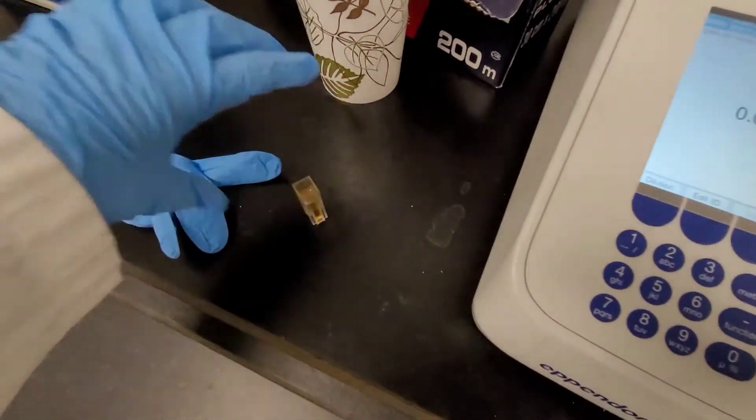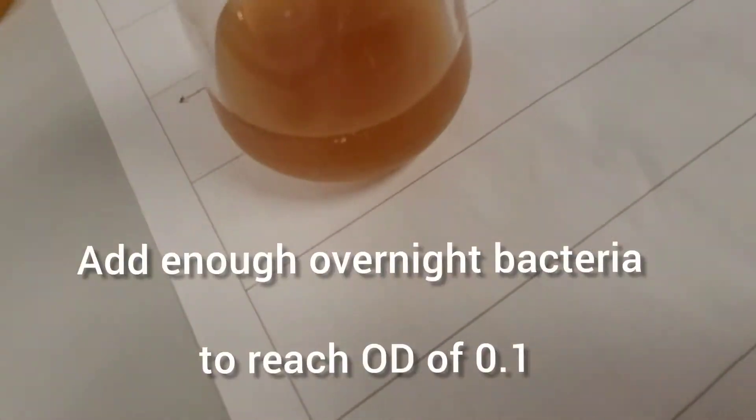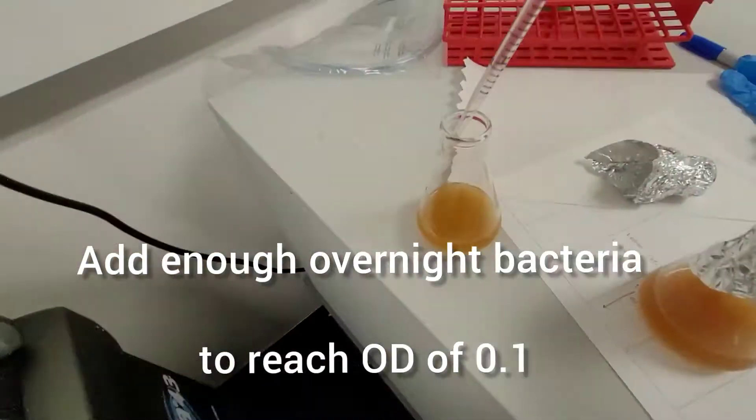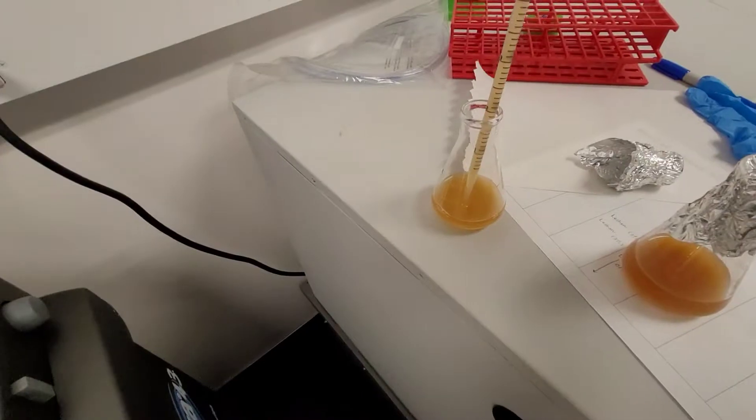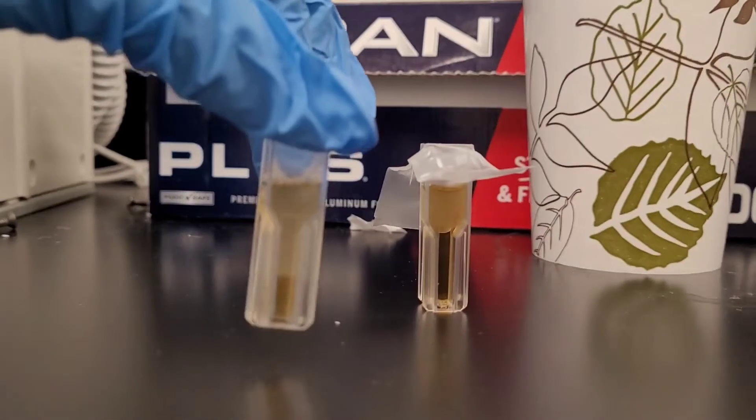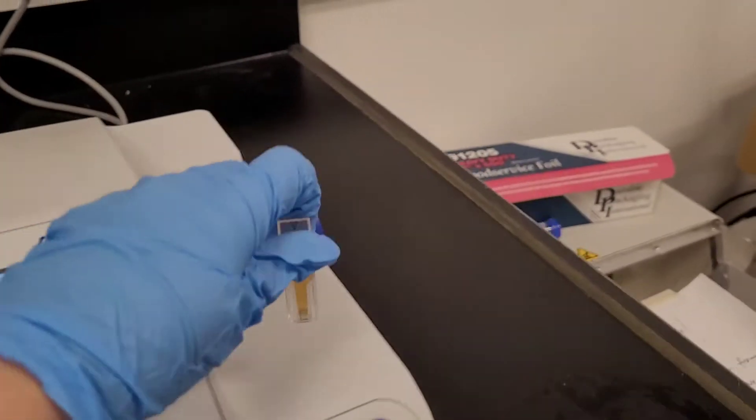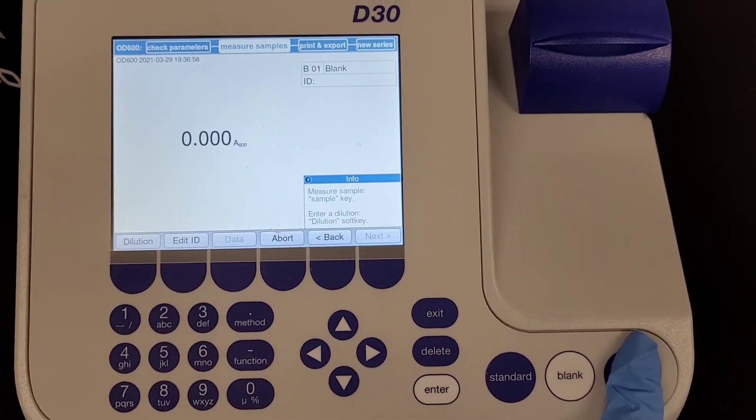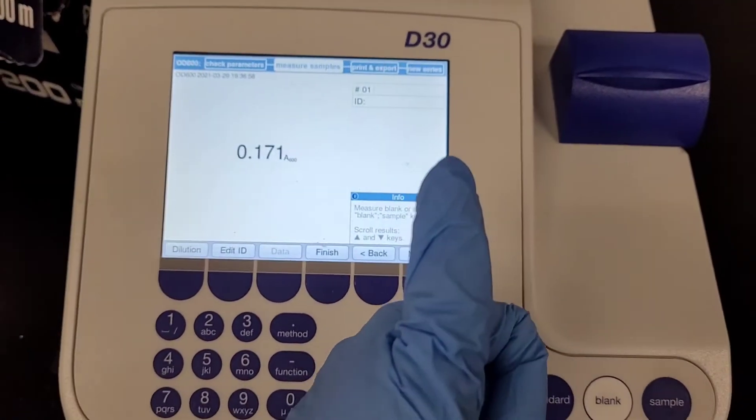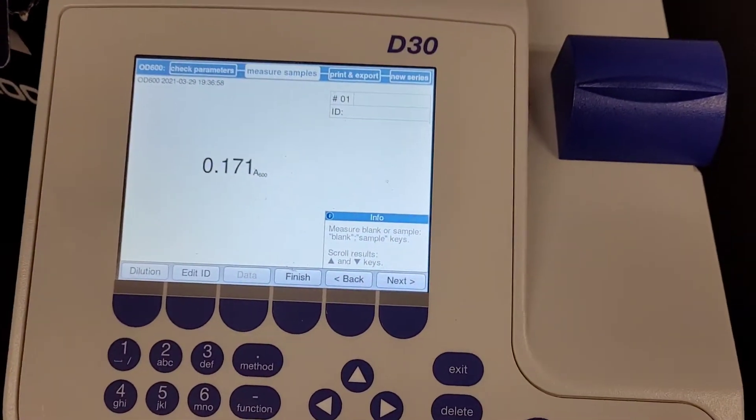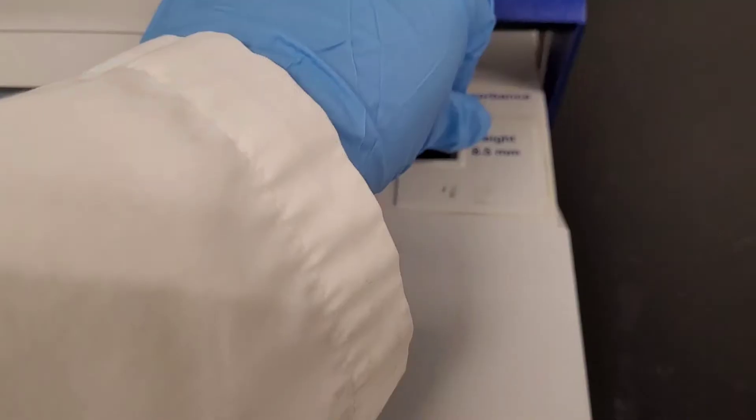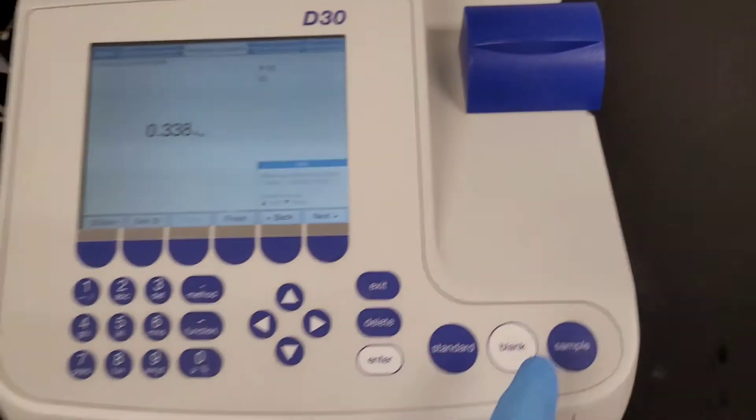When you put your solution that has bacteria, it should give you a positive value, not zero. Next, you want to add from your overnight culture enough bacteria to your clear one liter flasks so that your optical density or your cloudiness will be at least 0.1. 0.1 would be a great point to start. I did that, mine was a bit higher but it's fine. Definitely go for 0.1, 0.15, but don't go over 0.2 because you need some room for the bacteria to grow.